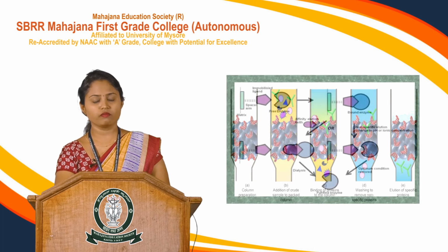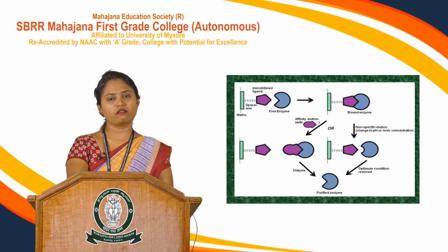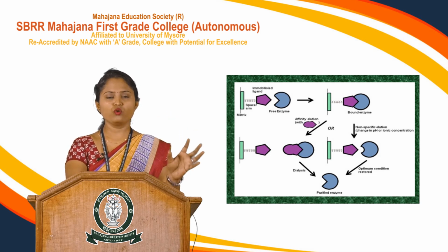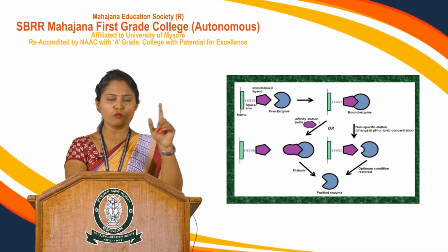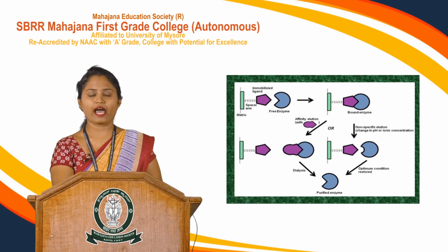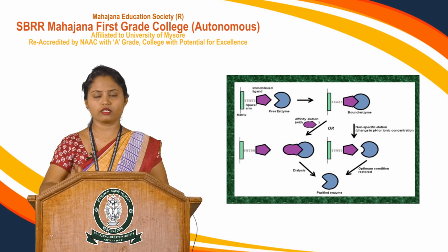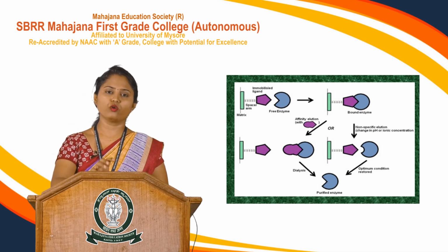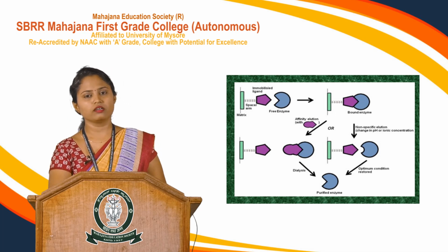It has been connected with a spring-like structure that is represented by the spacer arm, and the purple one represents the ligand which is immobilized on the matrix. Now, you can treat the enzyme which is present over here. The immobilized ligand, the purple one, will act as a substrate. So, this is the gel matrix. You are going to load it into the column. Once the substrate has been loaded, the next thing you are going to load is the different kinds of enzymes into the column.